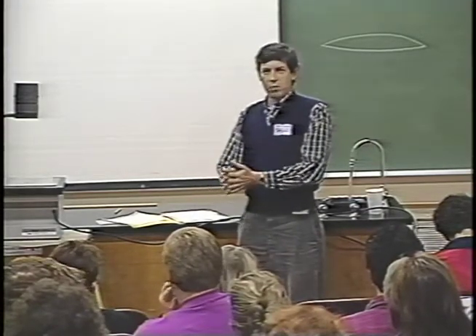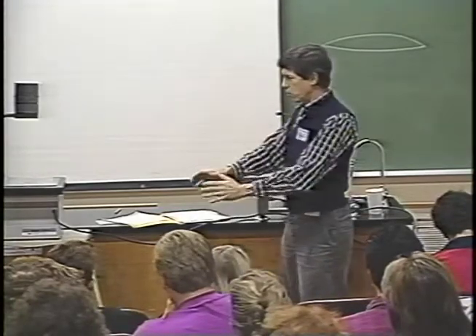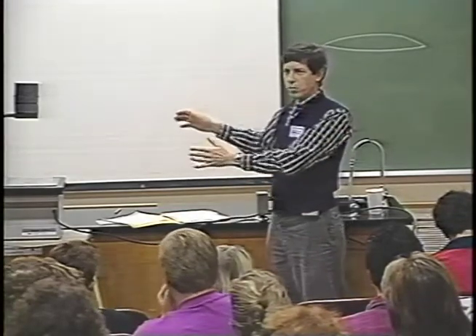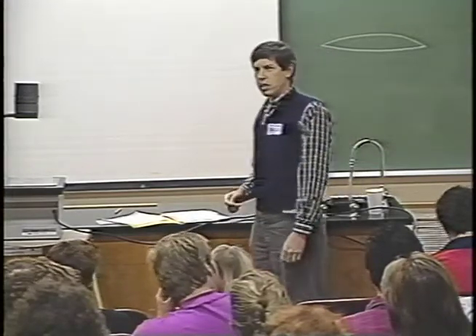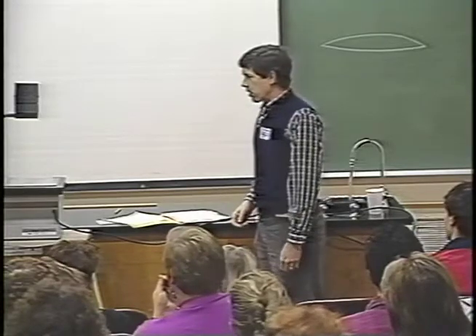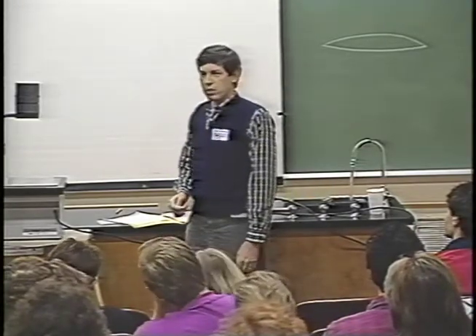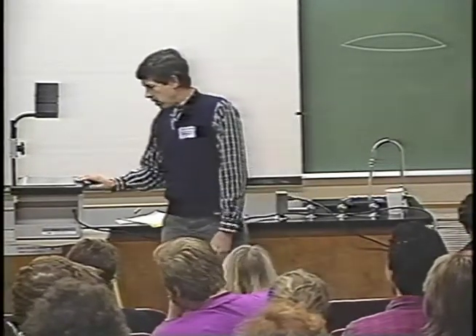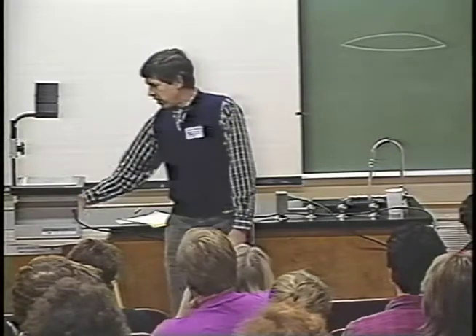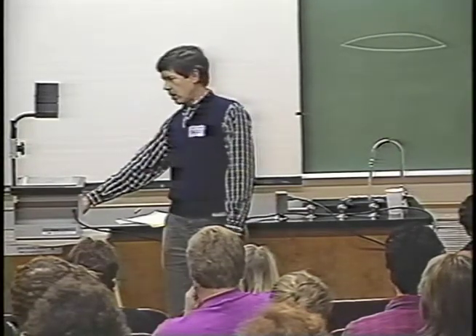I was talking with David DeRosier at the biophysics meeting, and his vision of the future is where you come in the morning with a specimen and poke it into your microscope and push a few buttons on the computer control, and by the end of the day you have your structure. Now, the world's population will increase a significant amount again by the time that stage is realized. But I guess we ought to move on to the reasons that things are better at high voltage.